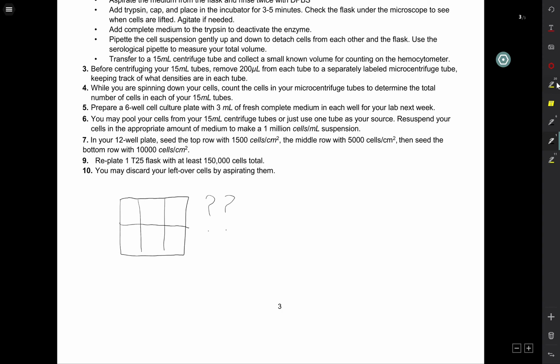Those methods will include different chemical methods such as MTS, BCA, and a live dead assay. These are different methods to assess the viability of your cells without necessarily performing something called an endpoint study where you actually kill your cells.